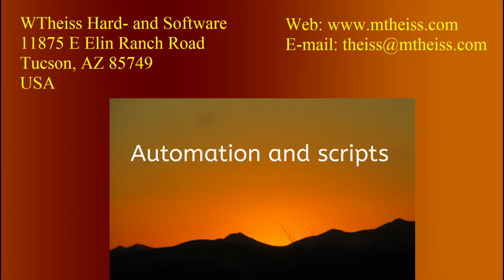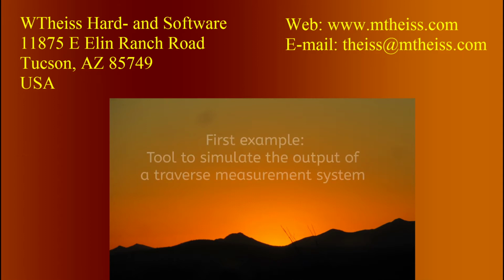A long time ago, I introduced in our Scout and Code software packages a simple timer that allowed to execute measurements and do some simple fittings afterwards and store the results. So you could realize a time sequence of measurements and fit results. In the meantime, I introduced scripts and triggers, and in a very simple example today I will show you how to use those tools together with automation.